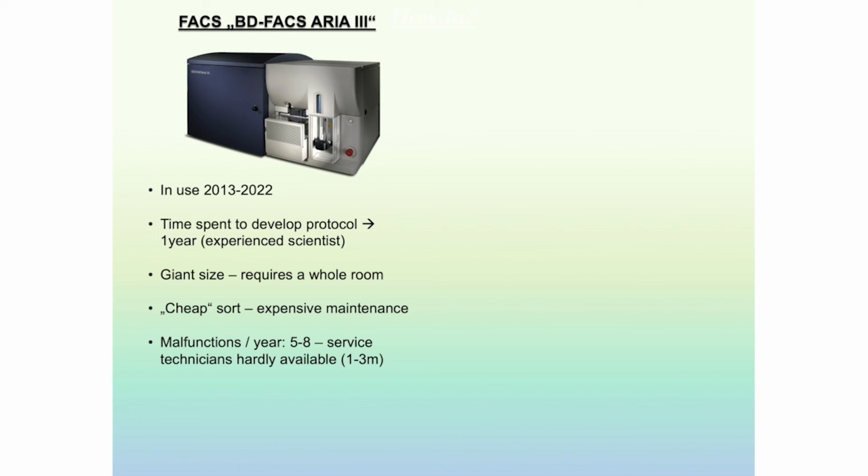So sometimes it takes them, especially during Corona, 1 to 3 months to perform service maintenance or assist with any malfunction. Another experience I had was time and time again that any service or maintenance changes my saved setups: pressure, speed, scan setup.